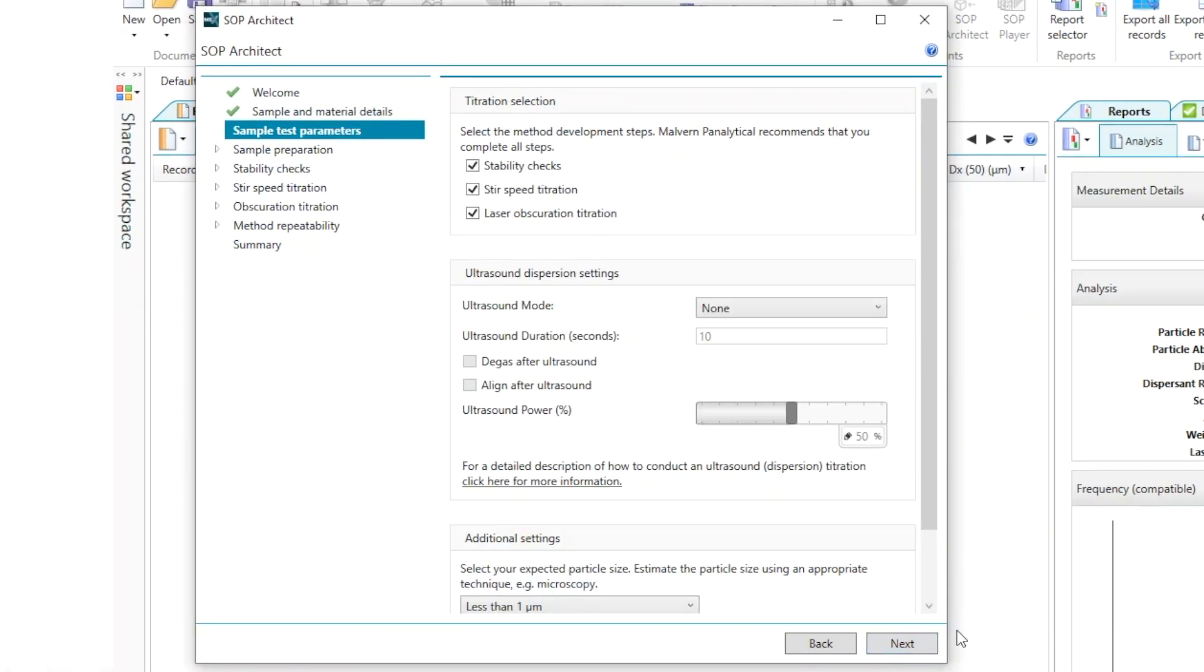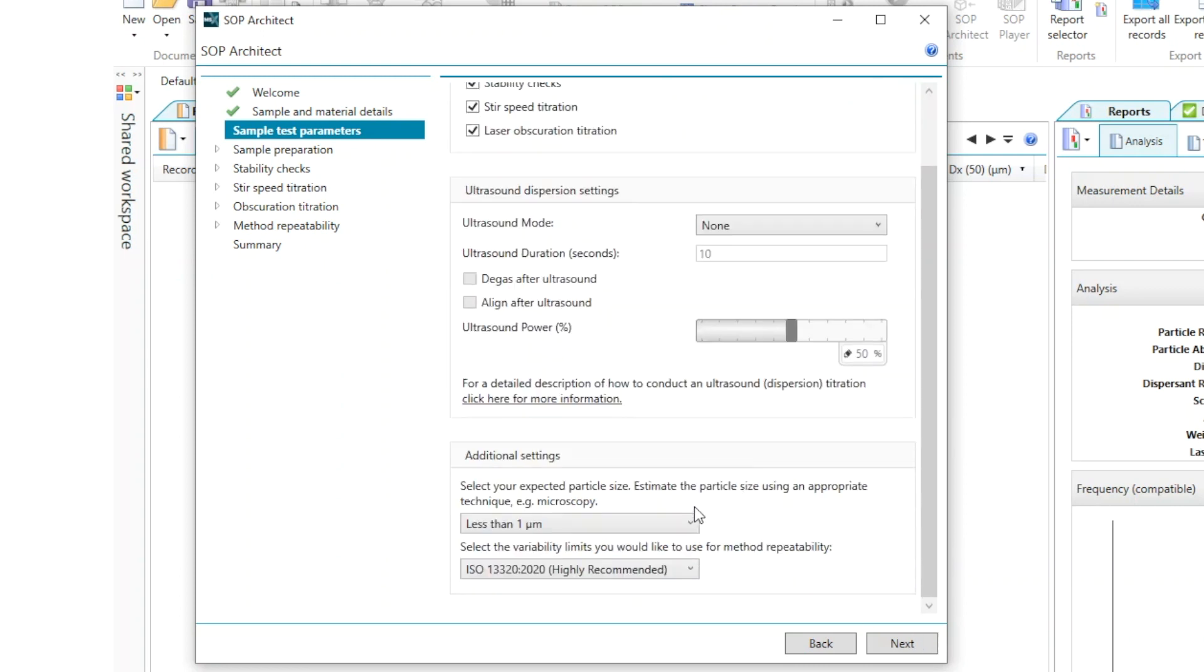From here we can select the method development steps that we would like to carry out. So today we'll first be looking at the stability. I'll be measuring this titanium dioxide sample in water and from there we'll be finding the optimum stir speed and laser obscuration for this sample. At the bottom of this page we also have the option of estimating the particle size that we're going to be measuring and this can help speed up any measurements that we'll be performing.